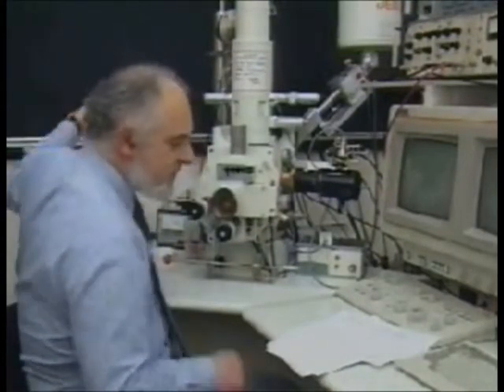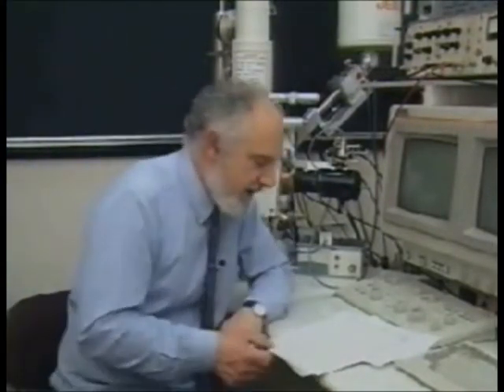What we actually observed in the film on the tungsten sample was a peak at 1341, but we think that this shift in the peak position is due to the small particle size and possible strain within the sample itself, in the film itself.